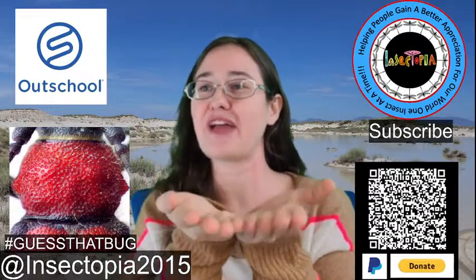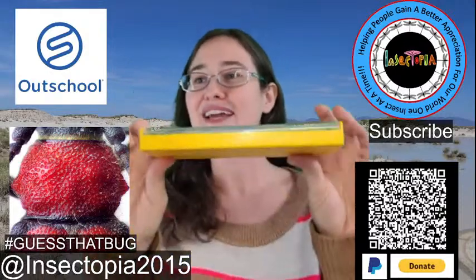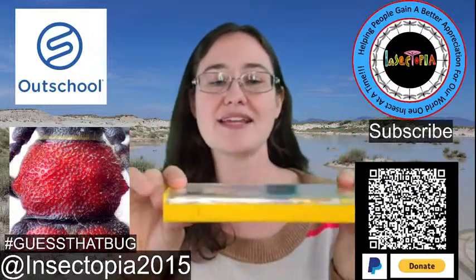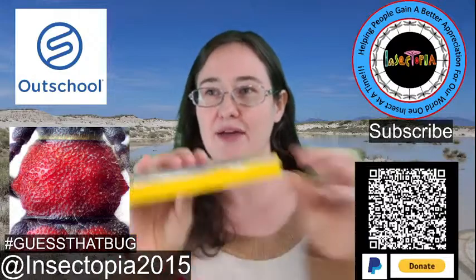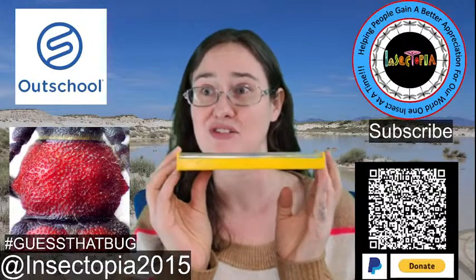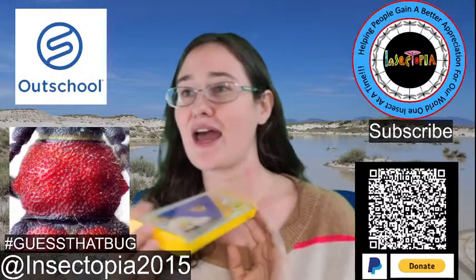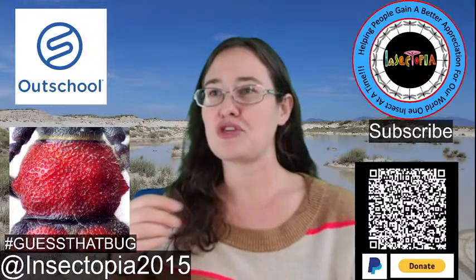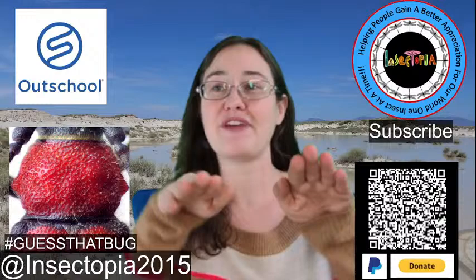you have to have a flat bottom container, kind of like this, where it's nice and flat. This has stuff in it, but it's nice and flat, and then you put a layer, a little bit of a depth, of acetone in it. You use acetone. And then the people that I've talked to that do this will use microscope slides, but anything that's kind of heavy and flat.